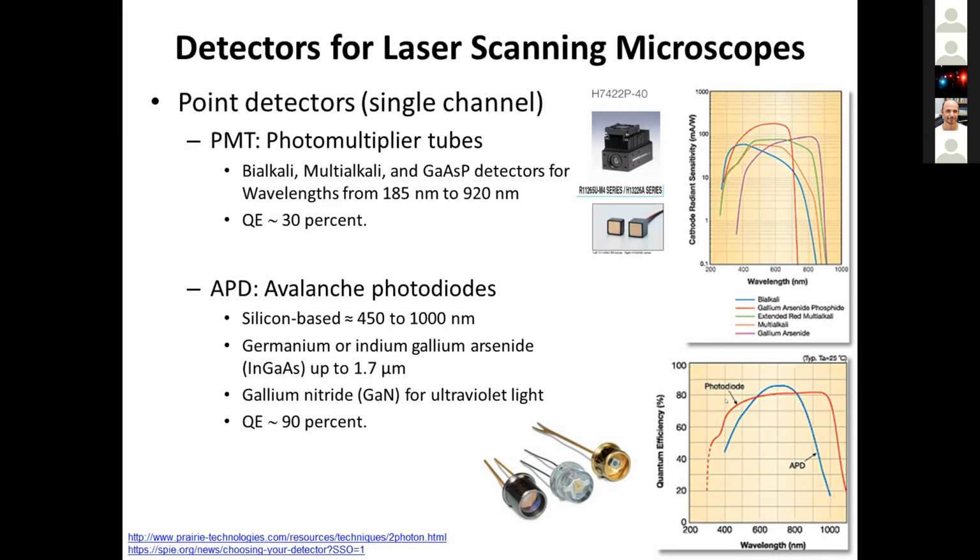The problem is, of course, that depending on the surfaces, you have different ranges. If you compare, for example, this APD with the gallium arsenide photodiode, which is this one, you may see that the range is much larger for the gallium arsenide photodiode.